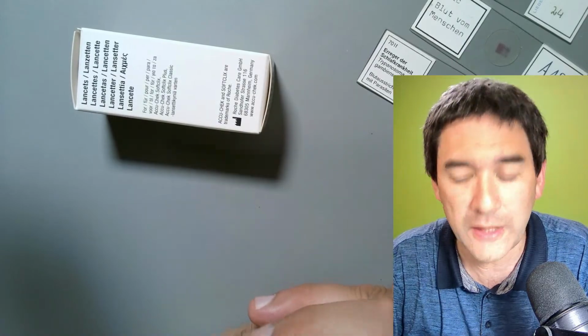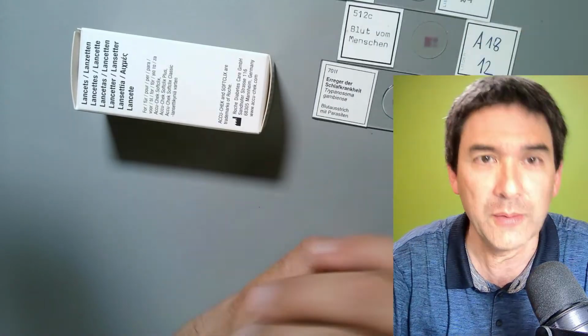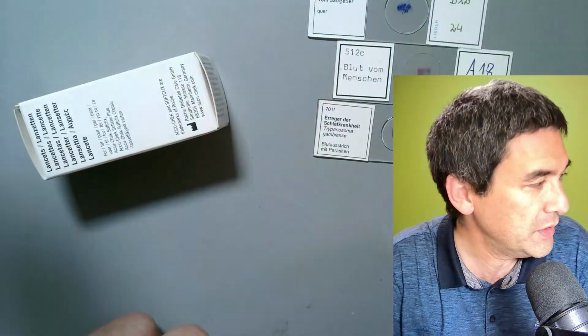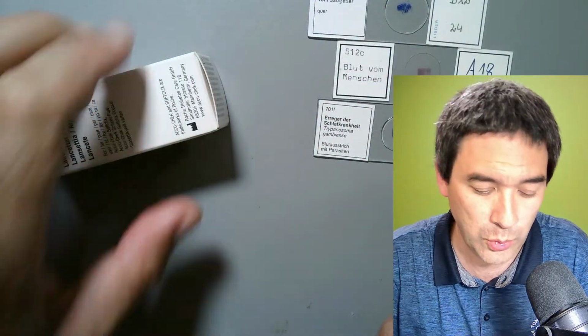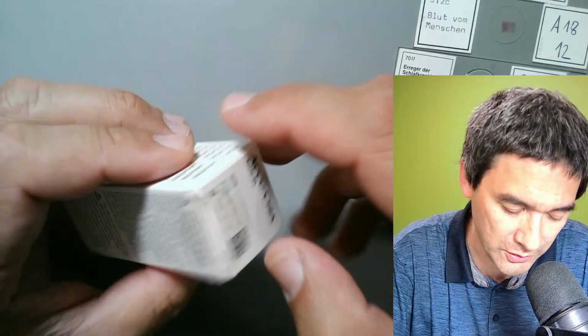So what I'm going to do now is the following. I just realized that I actually forgot something. I actually wanted to also show you what happens when you add salt water to blood. I'll see if I'm able to do this as well. I forgot my salt water.